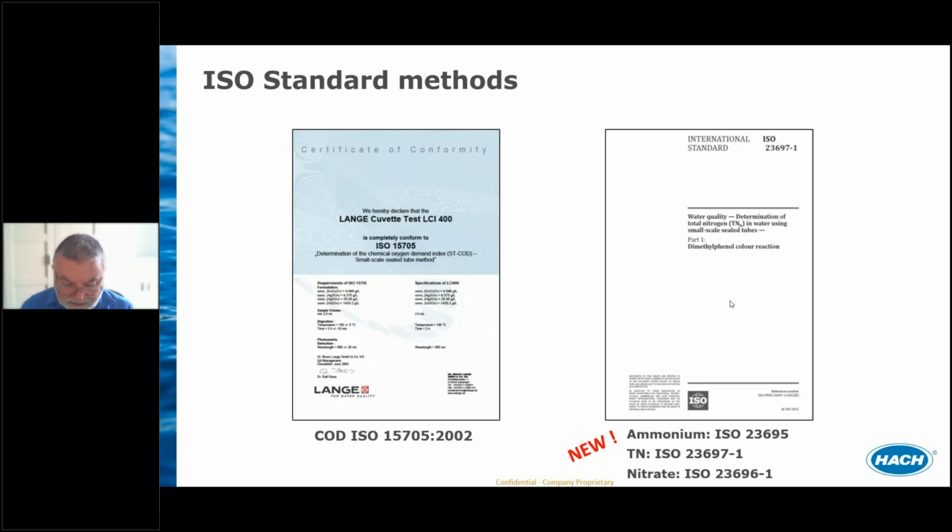But some of them have been the subject of a separate standard. COD cuvette tests have already been standardized for many years. But nitrogen methods were also standardized very recently in 2023, which allows for simplified implementation in the laboratory.